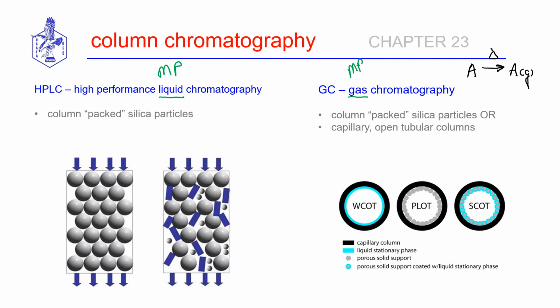Okay, so GC is an easier method to use. We'll talk more about this later. So if you have a choice, you want to prefer to use gas chromatography. But if you're dealing with thermally sensitive materials or those that have a high boiling point, you are going to do liquid chromatography. And the latter is the preferred format of separations for biochemical research, where we're dealing with those kinds of sensitive compounds that are either large in nature or degrade with temperature.